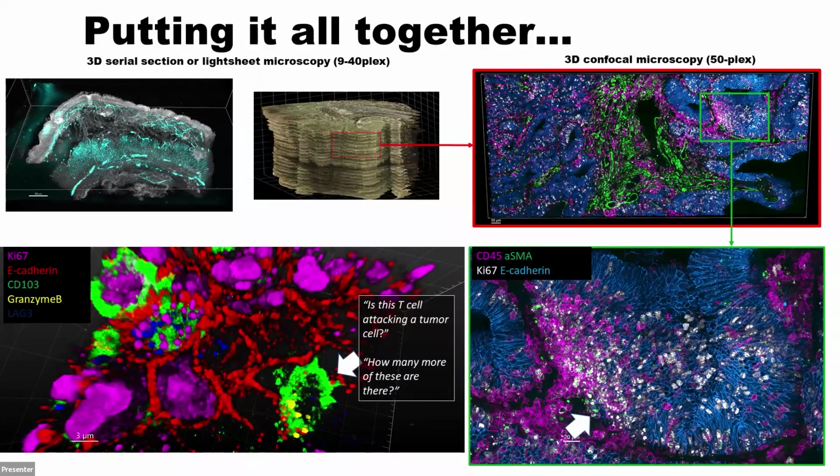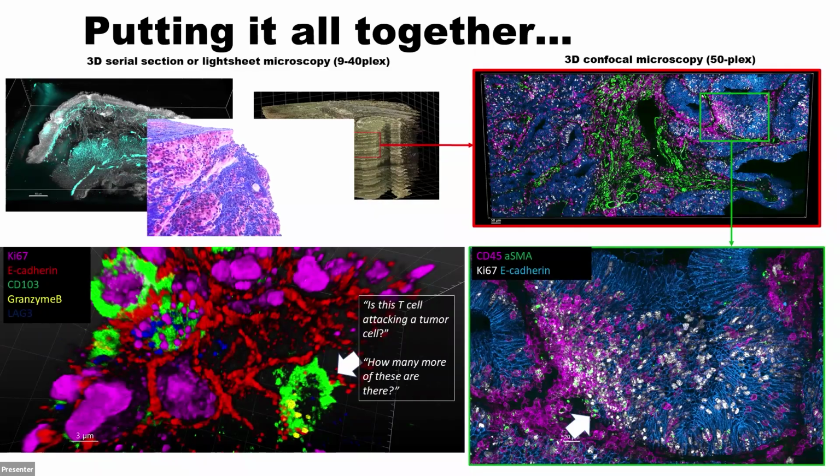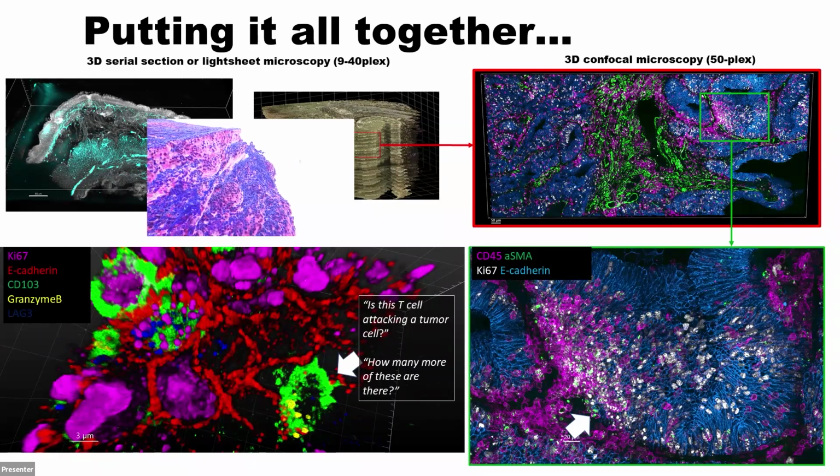So we've covered high-resolution confocal microscopy, virtual H&E imaging, and light sheet microscopy. Can these offer some complementary advantages with each other? And therefore, an interesting concept that has been floating around is to use light sheet imaging to get either a virtual H&E image with a medium number of targets, maybe 10 to 15 channels, and this allows you to identify coarsely where something biologically interesting is happening.